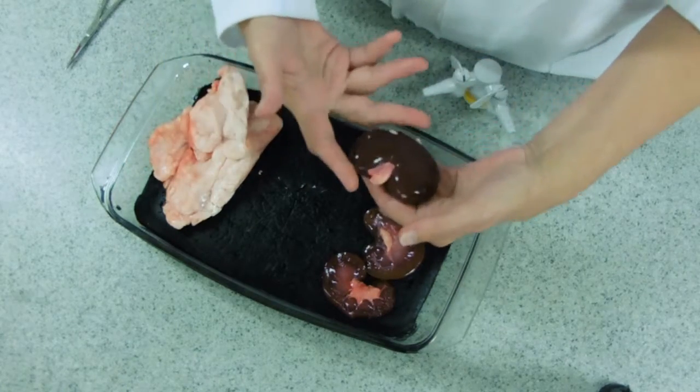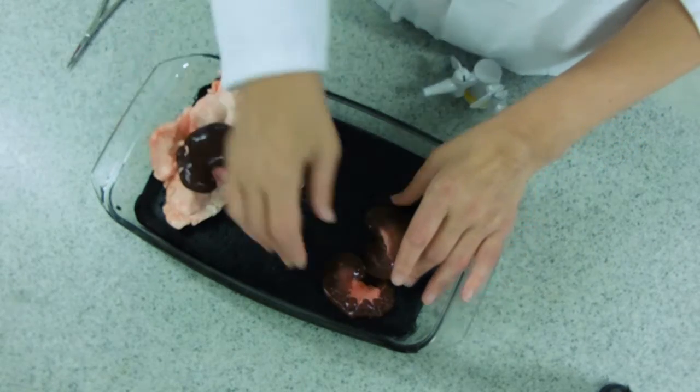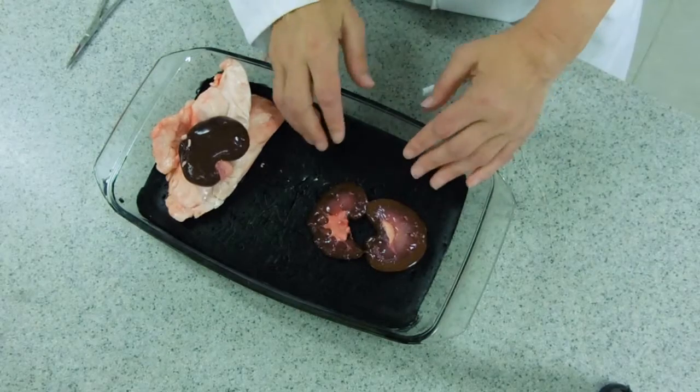When you're cutting the kidney, it's a traditional sort of cut across so that you end up with two kidney halves. These are actually from two different kidneys, which is why they look different colours.